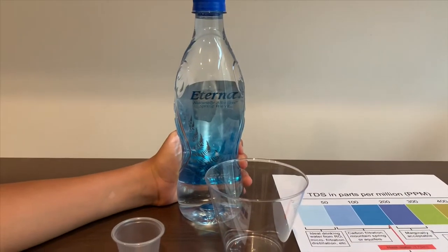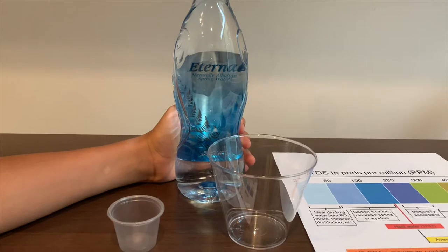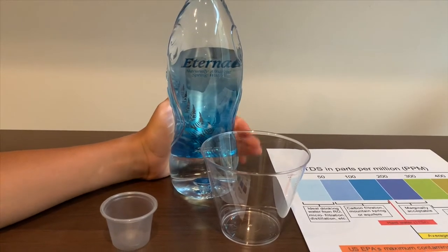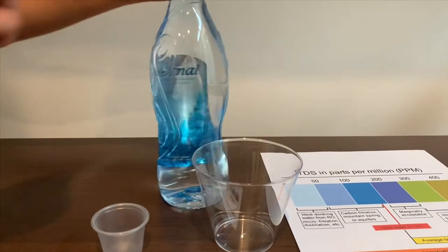This is Eternal naturally alkaline spring water. Today we're going to test its pH level and its TDS level. Let's pour some in.